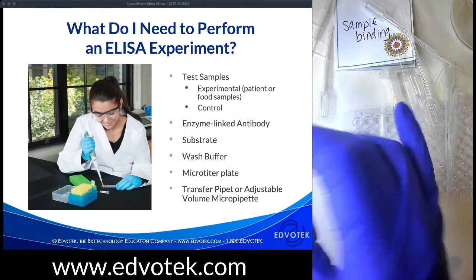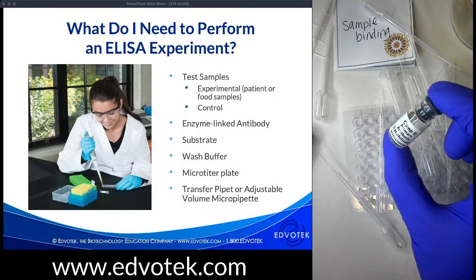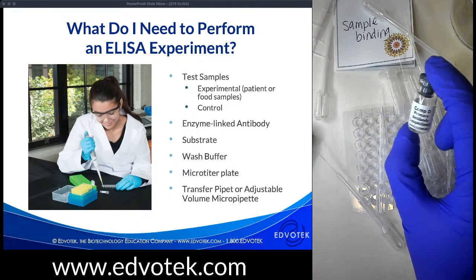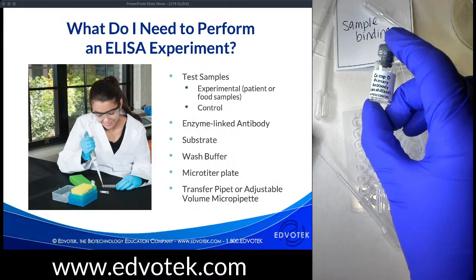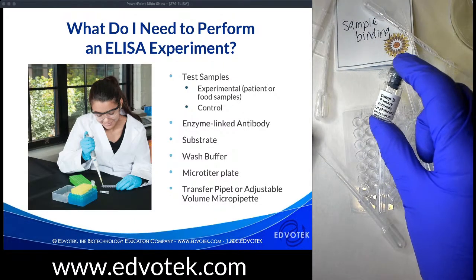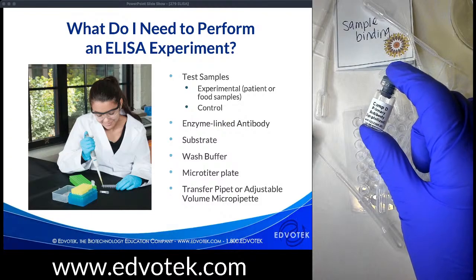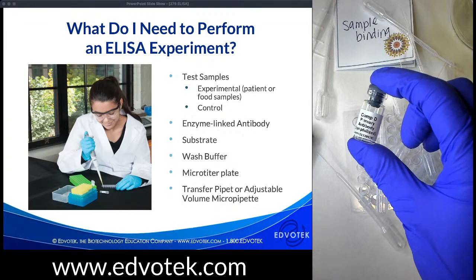We talked about the primary antibody. This is going to be the antibody that is going to detect. Oh, do I not have primary antibody on here? I do not have primary antibody on my slide. Oh my goodness. I will amend that if you decide to get the slides from me. The primary antibody is the antibody that is going to recognize our antigen.